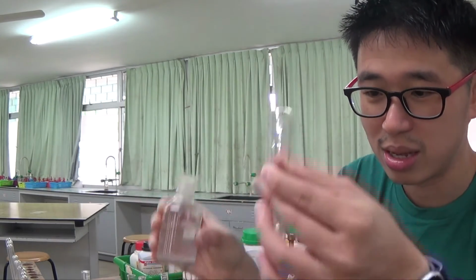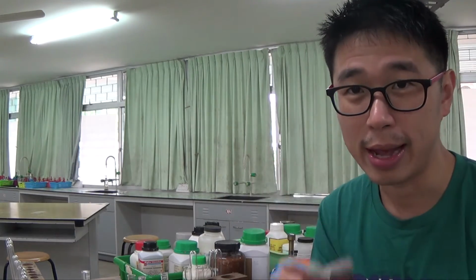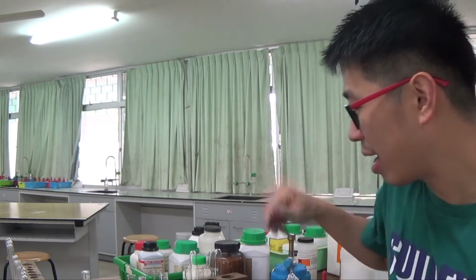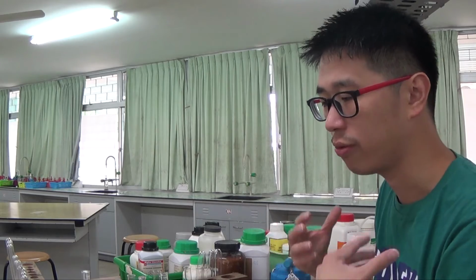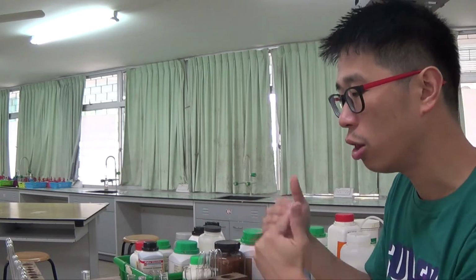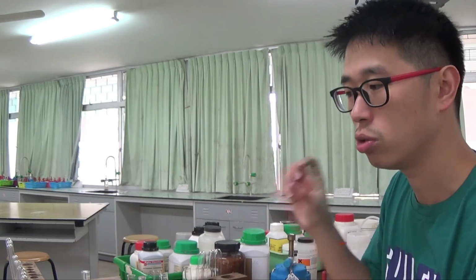Let me try this. Yeah, it's very faint actually. So the fact that I knew there was Al3+ in there means I'm really sure there should be a precipitate. So I need to try and get a lot more of the solid. So that's why, like in Cambridge exams, they have this instruction for examiners. We need to make up the solution to a particular concentration, because when I don't have a lot of the solid, that means I have very low concentration. Sometimes you don't see it.